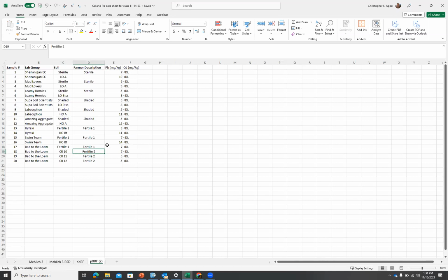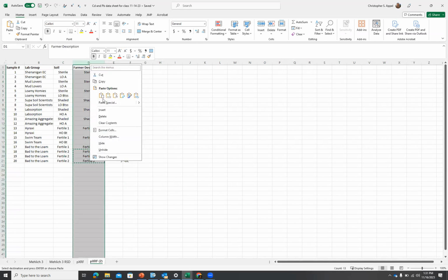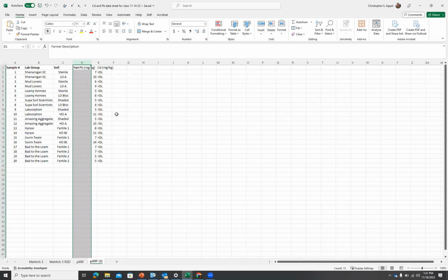The first one I spelled wrong, but the other ones I spelled correctly, which is weird. Okay, there. Then I'm just going to get rid of my column that says farmer description. I don't need that anymore.